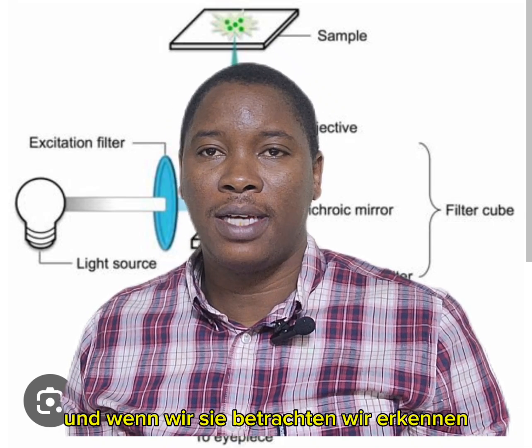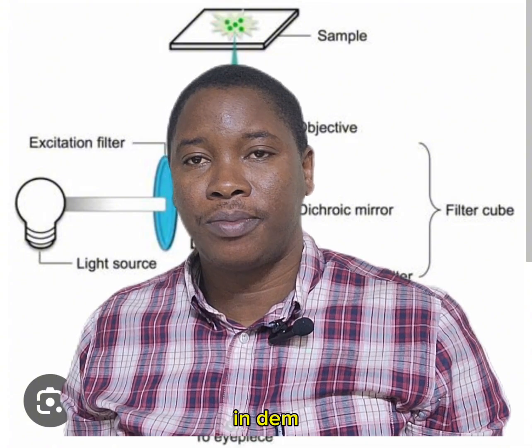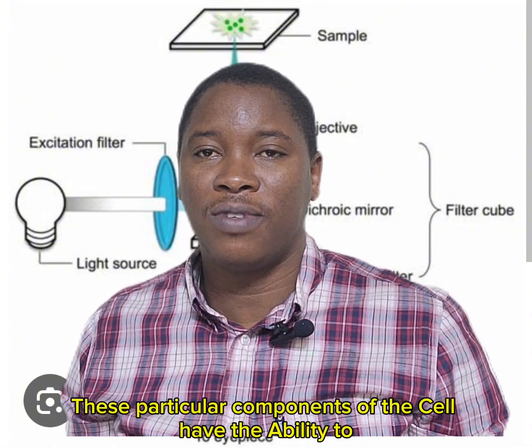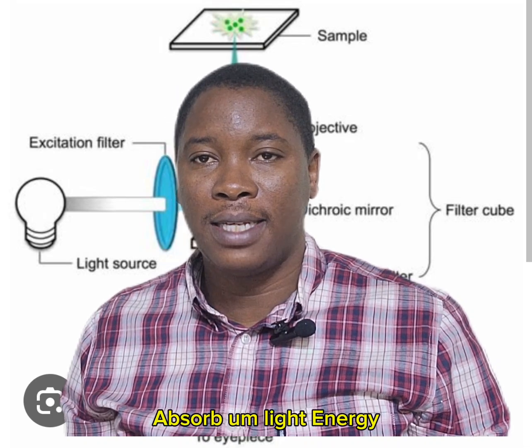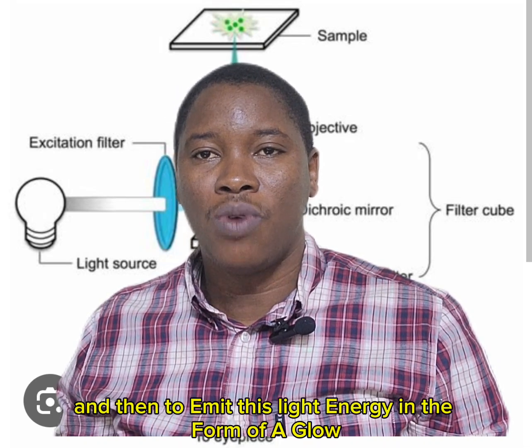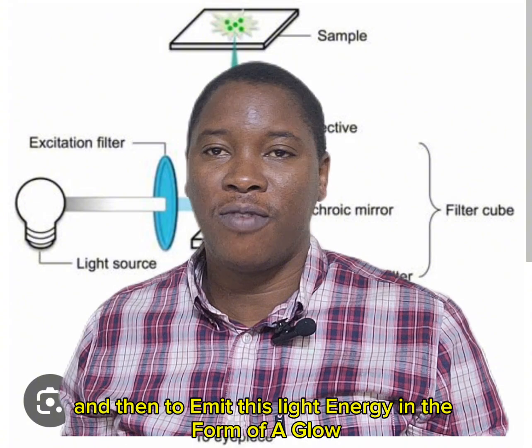When we view them, we realize that particular components of the cell have the ability to absorb light energy and then emit this light energy in the form of a glow.